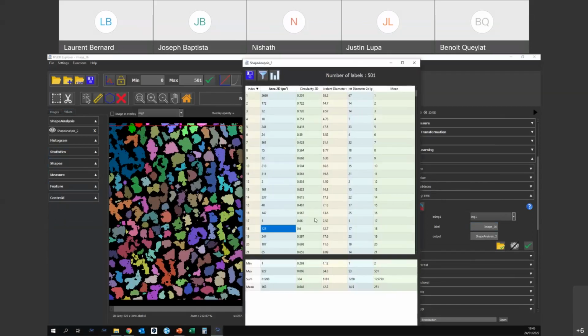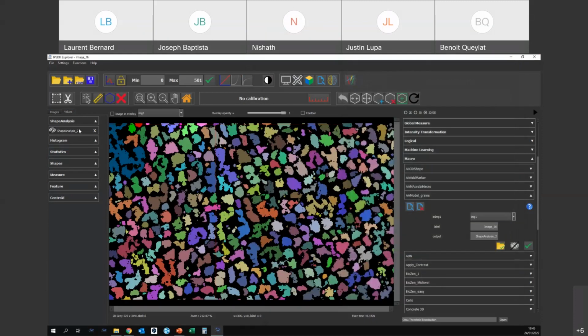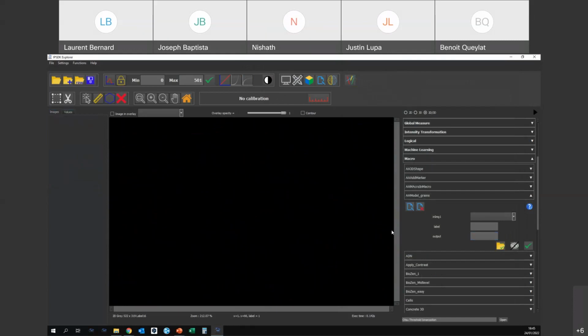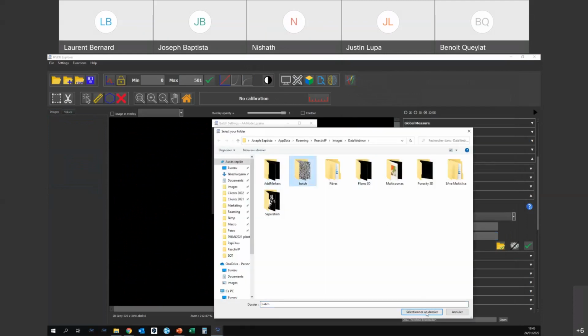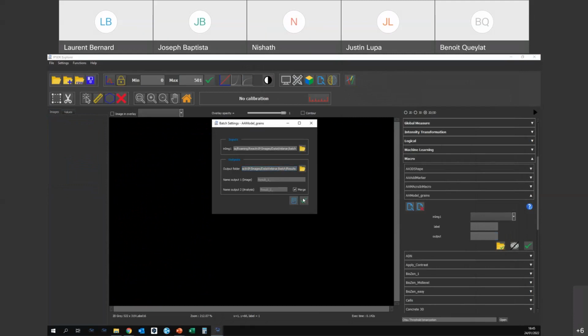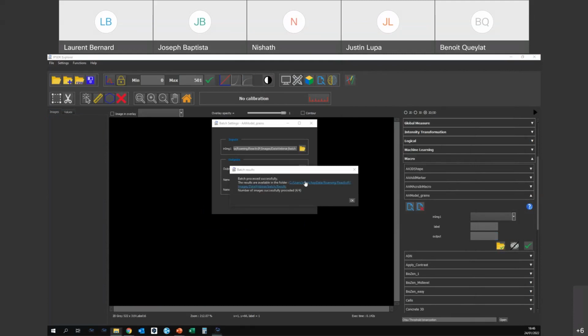And as you know, there is a connection between the image and the spreadsheet. Now, if I want to replay my scenario again and again on all the images, I'll just remove everything and restart with my same element. It will be written in my result folder. I can also merge my results if I want. Merging means that you will get one result per image, one spreadsheet per image, but you can also combine all the results in the same spreadsheet. So it's being computed. The folder is on my second screen.